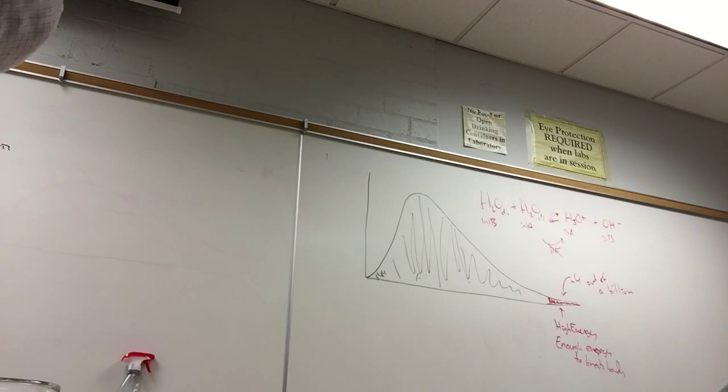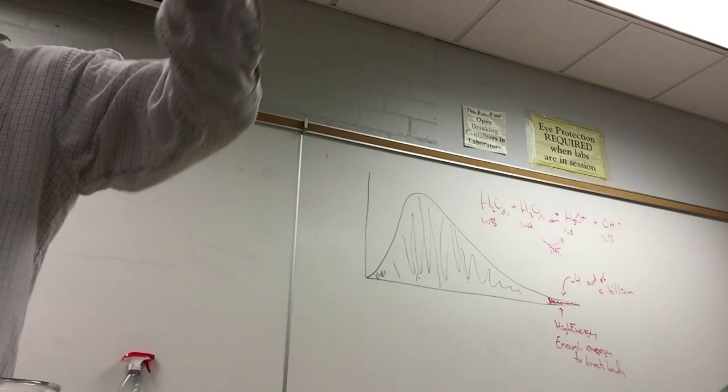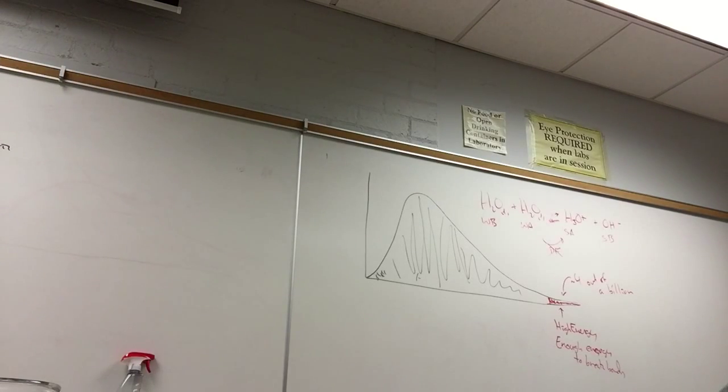So I have some solid sodium chloride in the beaker here, and so let's test its conductivity. Sodium chloride, solid, should be a good conductor of electricity. No. Solid sodium chloride is not a good conductor of electricity. Why?